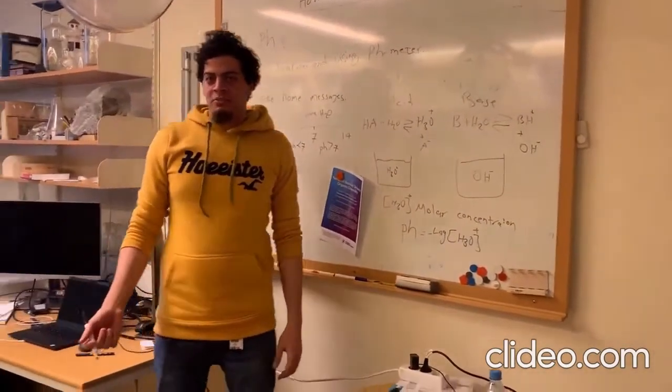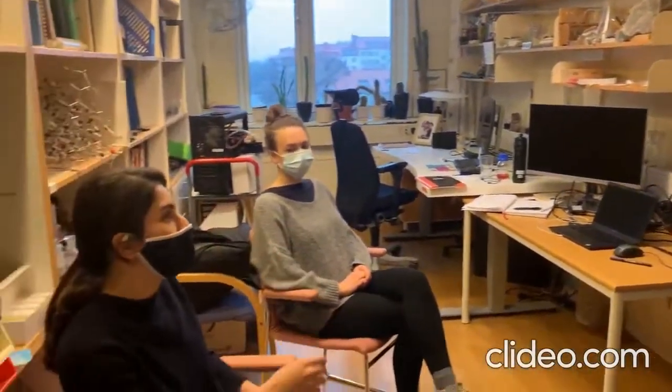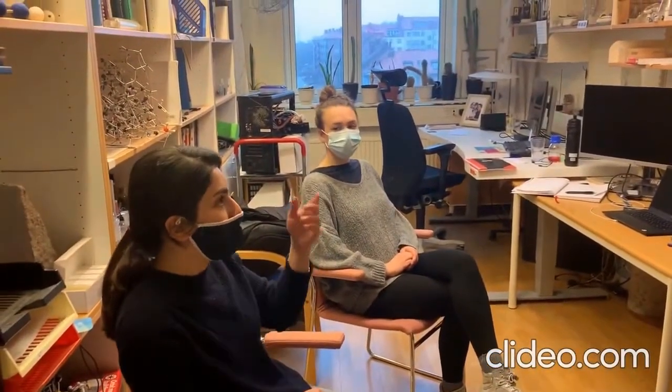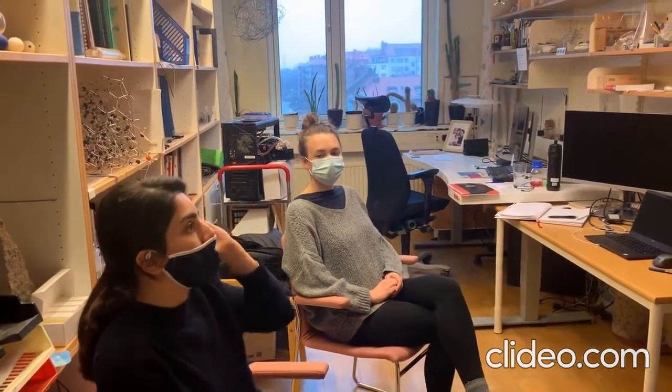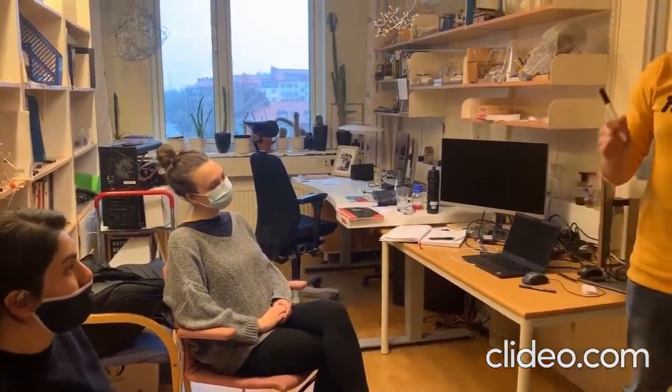Nice. Okay. Any questions? May I ask something? Yeah, sure. How does this pH meter work in order to measure the pH? That's a very good question.